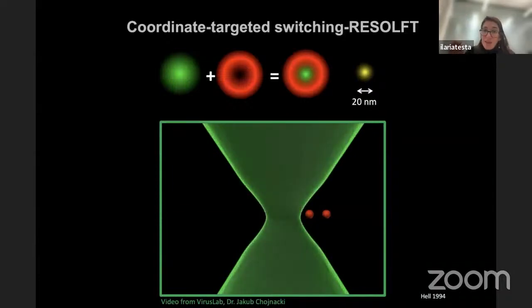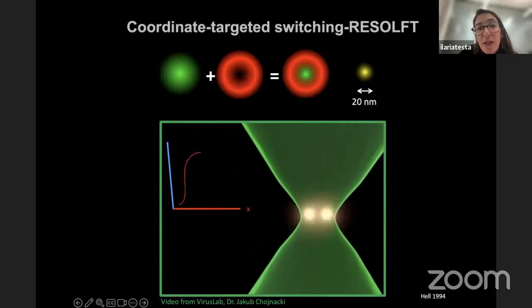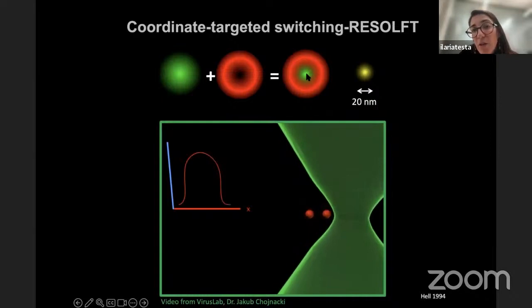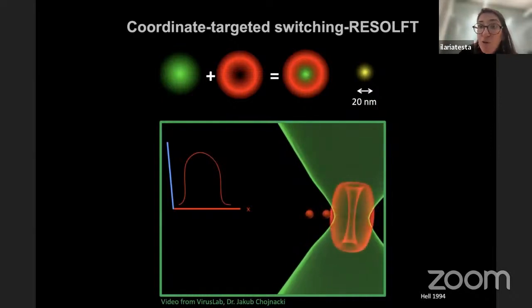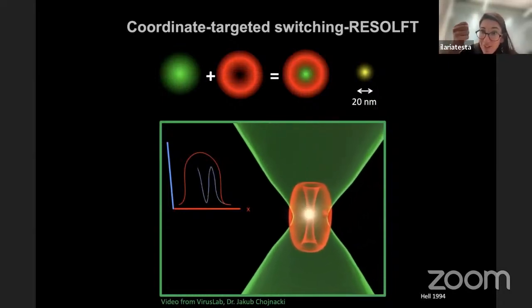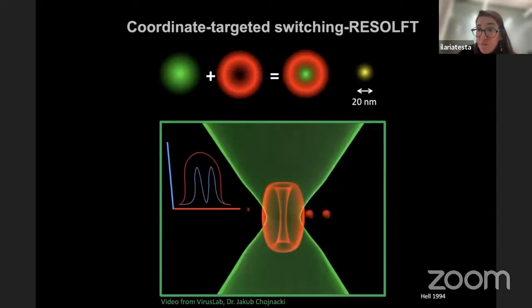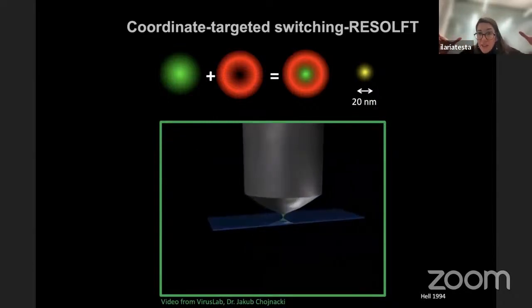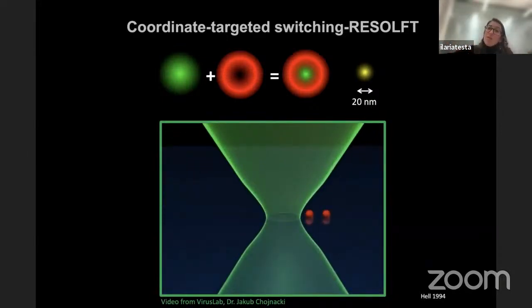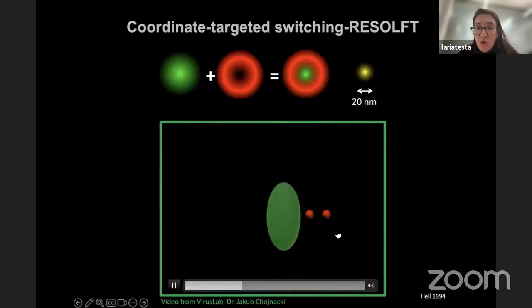The molecules that see the red photons are the ones that get depleted. So they are emitting, but not at the light that we detect. So the result is that the ones that interact with the photon are off. So the only ones truly located in the zero at the center are able to emit. And those are located then in a very nano-sized volume. And this is exactly where you generate the high spatial resolution information. So this is the concept, basically depleting the ability of the molecules to emit fluorescence and letting only the few in the center still behave like a normal conventional fluorescent molecule.